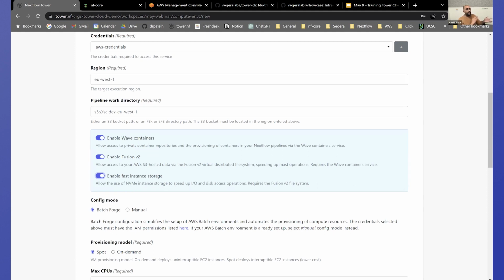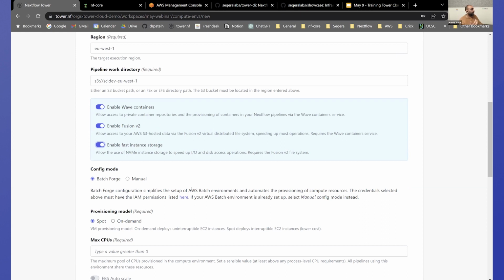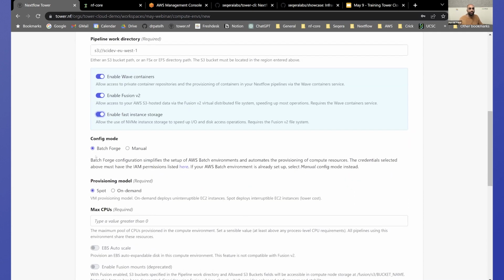So it really helps with moving data around the cloud, which can be a big limitation with some of these APIs that the cloud vendors have. You hit API limits and pipelines start failing, which isn't nice. And so we've added this to sort of overcome that and make things a lot more efficient. And we're building on top of this to do other really cool things like auto deleting intermediate files and that sort of stuff down the road. So there'll be some good announcements, I suspect, at the Barcelona summit in October.